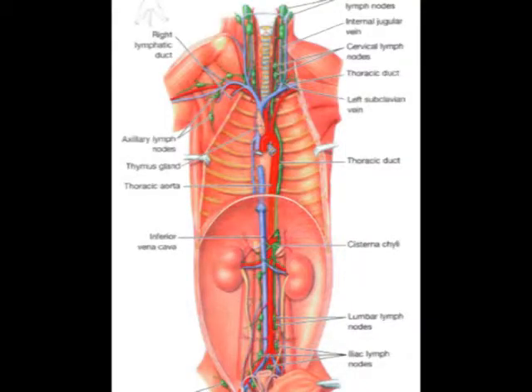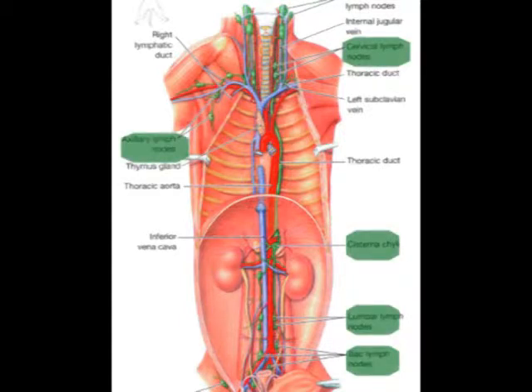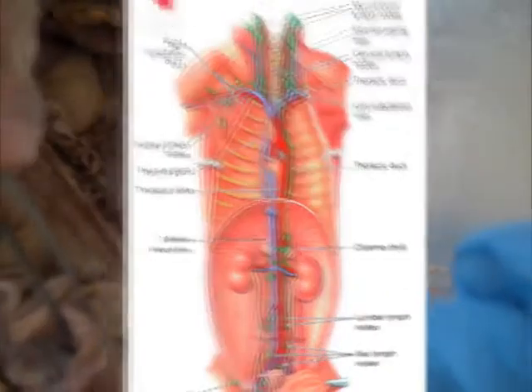The lymphatic system is found throughout the whole body. It is usually found around major arteries and veins of the cardiovascular system. It is used to clean the body of toxins. It also helps with the immunity of the body found in most living organisms. The highlighted parts of the pictures that you see now are the parts of the lymphatic system that you will see in our footage.